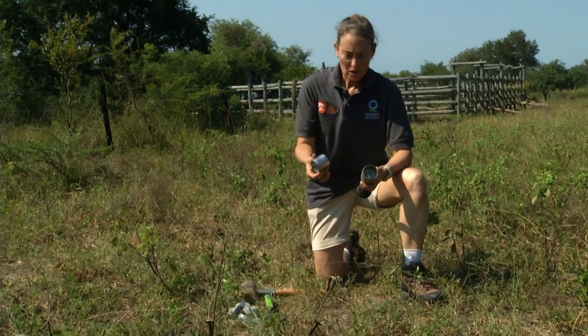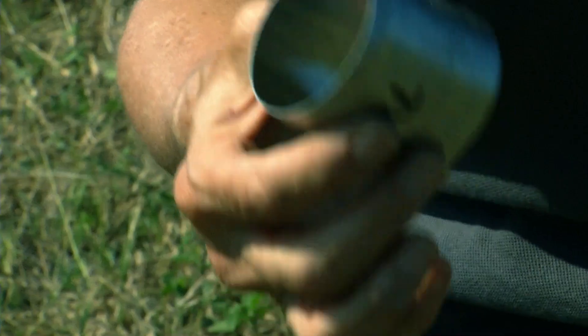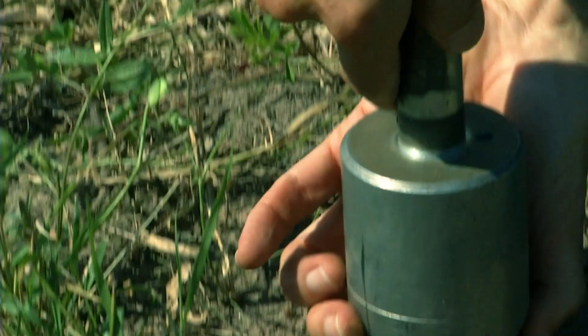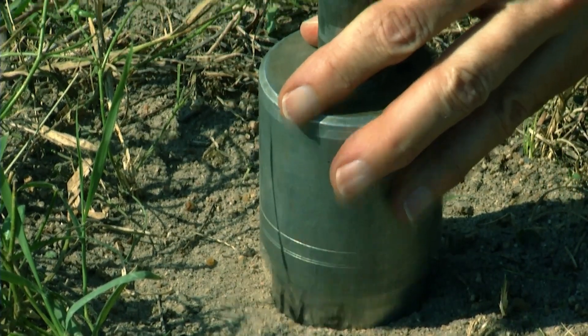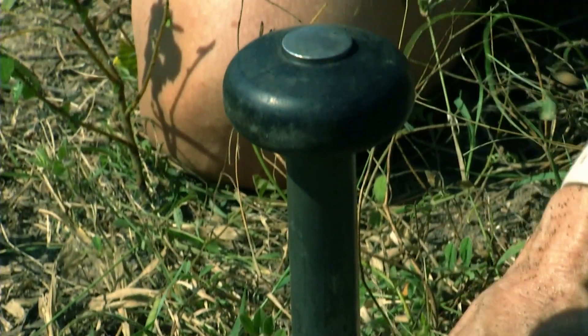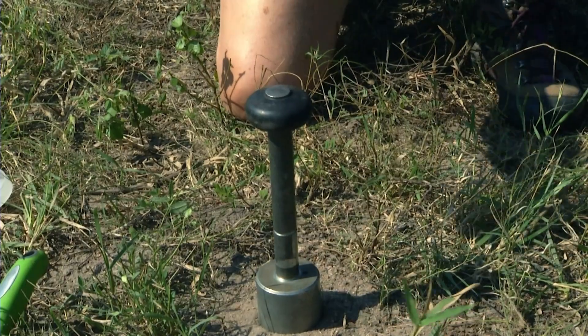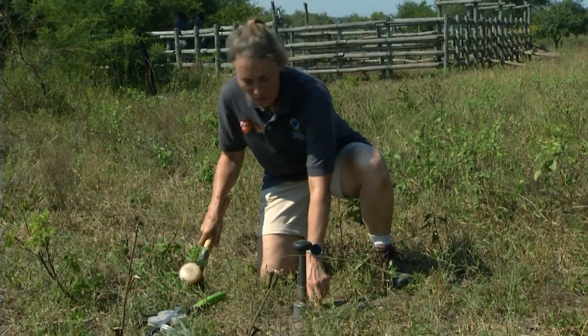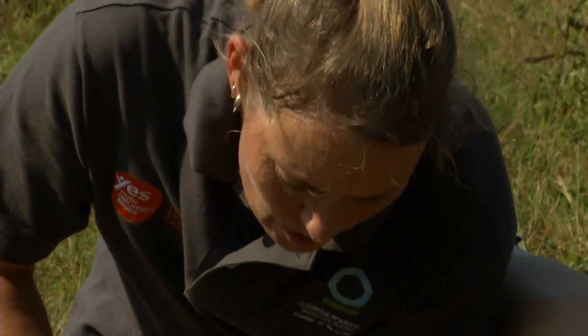Now we're going to do bulk density. You get an exact volume of soil in this ring. Use this ring, put it into this gadget, and you knock that into the ground — carefully and straight. Knock it in to the midline and then dig it out.